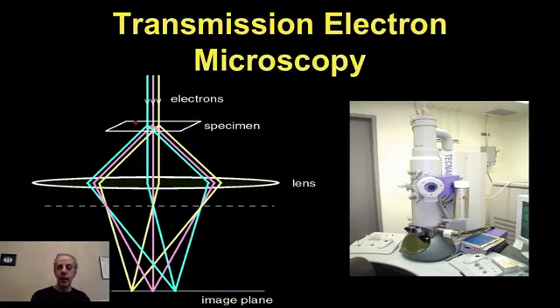We basically have a specimen with HIV, for example, but other specimens are possible as well. Microscopy is used all over for biological research. It's like you throw electrons into the specimen, and you let them just go through. You capture the image of the specimen by measuring how the electrons go through. And we see that in this diagram. There is a lens, and there is the image plane. That's where things basically get captured.